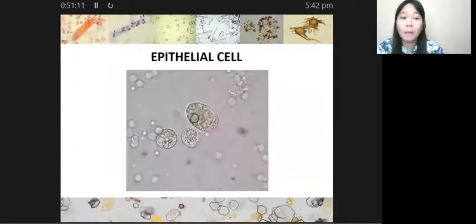But in your bubble cell, you would be able to see yung vacuoles niya. If you view this under your polarizing microscope, it will not have Maltese cross formation. It will not have an orange-red color in your lipid stains, indicating that it does not contain any lipid. Okay, so we have here your bubble cell.